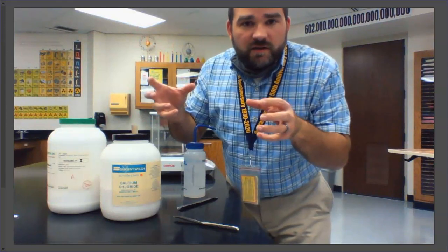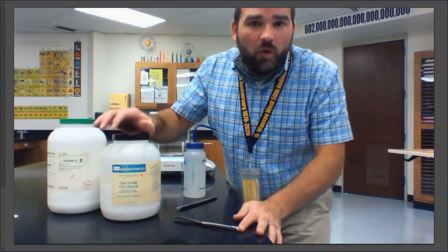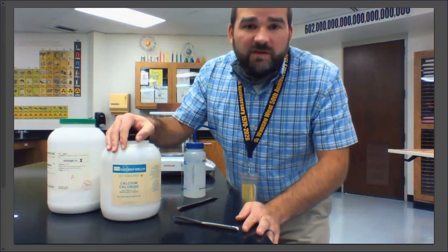A precipitate is when you have two aqueous solutions, meaning something is dissolved in water. I mix those aqueous solutions together, and then a solid forms. The solid is what's known as a precipitate.